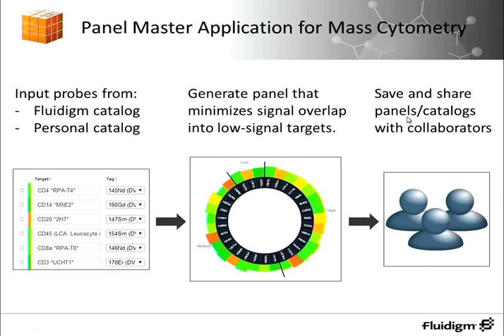Once those panels have been created, you can save and share them with any collaborators. You can also go back in the future and redesign or create more panels from what you've already made.